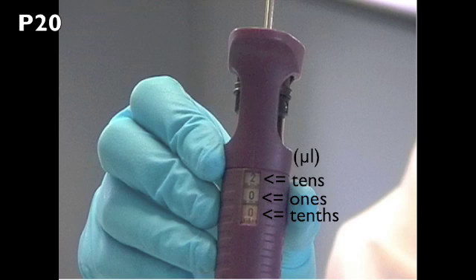On the P20, the first number displayed represents tens of microliters, the second number represents ones of microliters, and the third number which is red represents tenths of microliters.